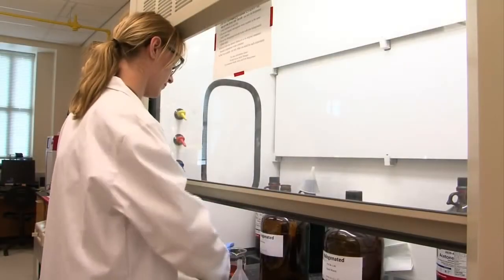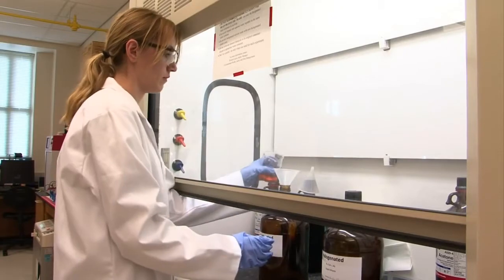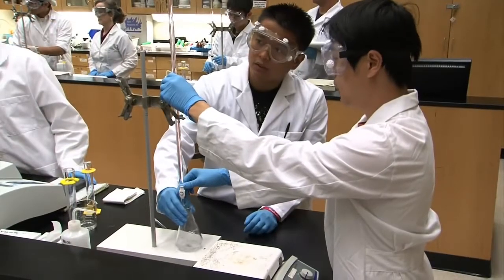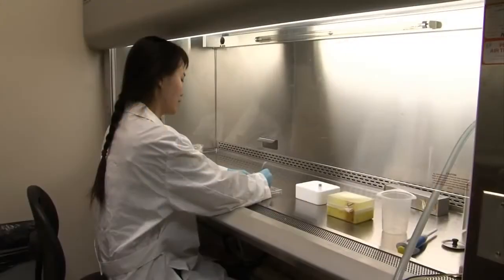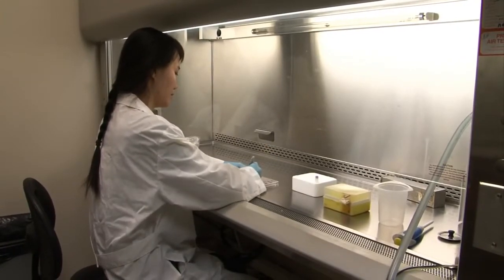The Laboratory Safety Division of the Office of Environmental Health, Safety, and Risk Management has developed a set of guidelines to ensure the safety of faculty, staff, and students working in university laboratories. It is critically important to become familiar with these guidelines as you begin working in a lab environment.